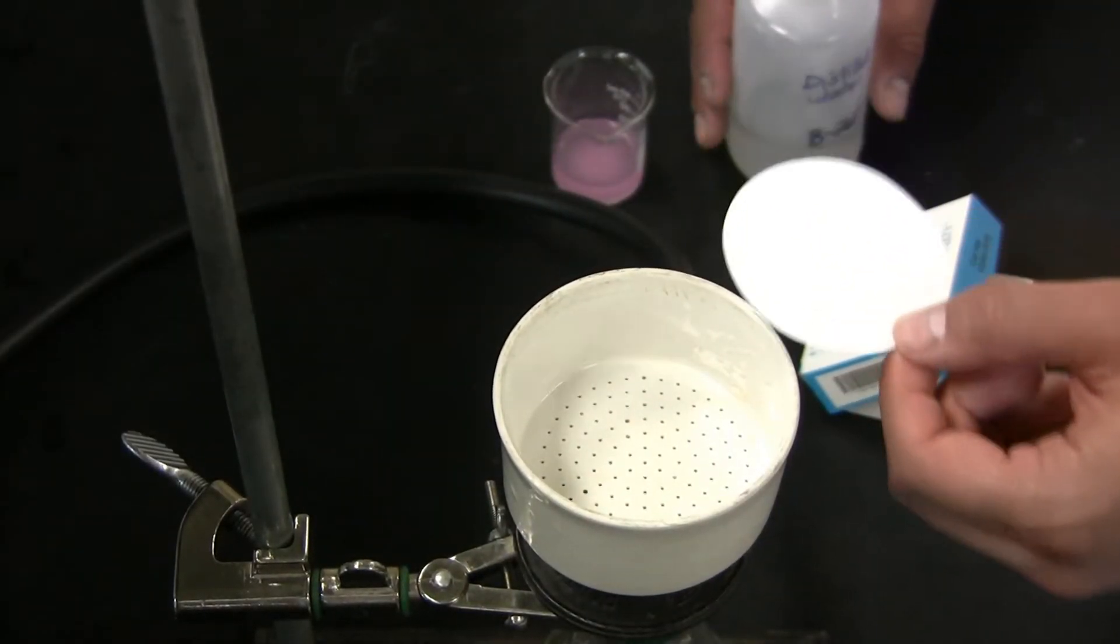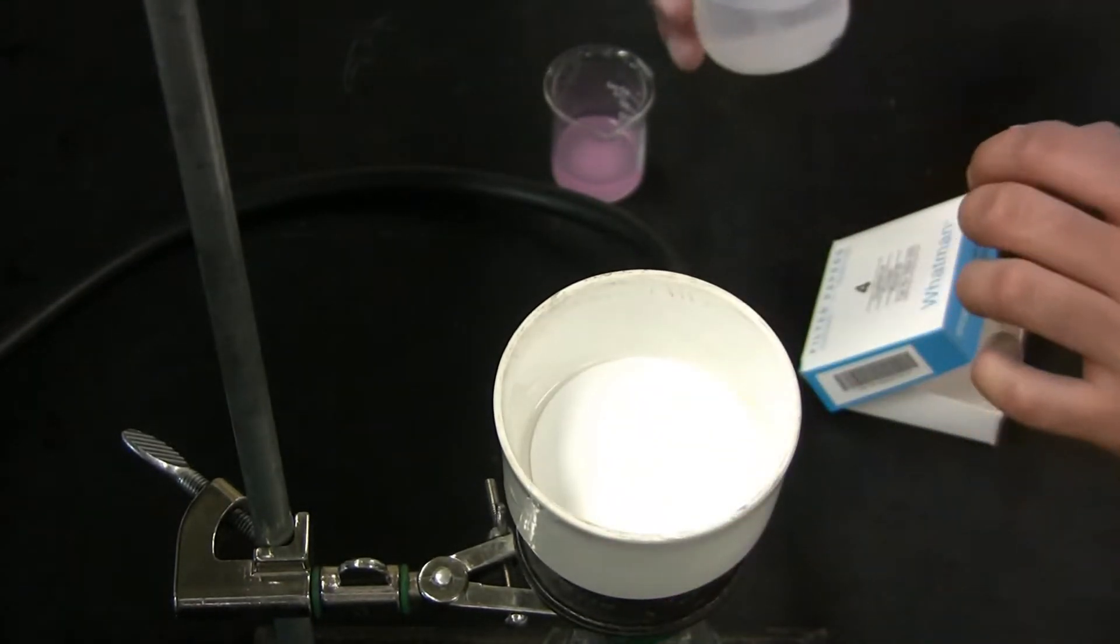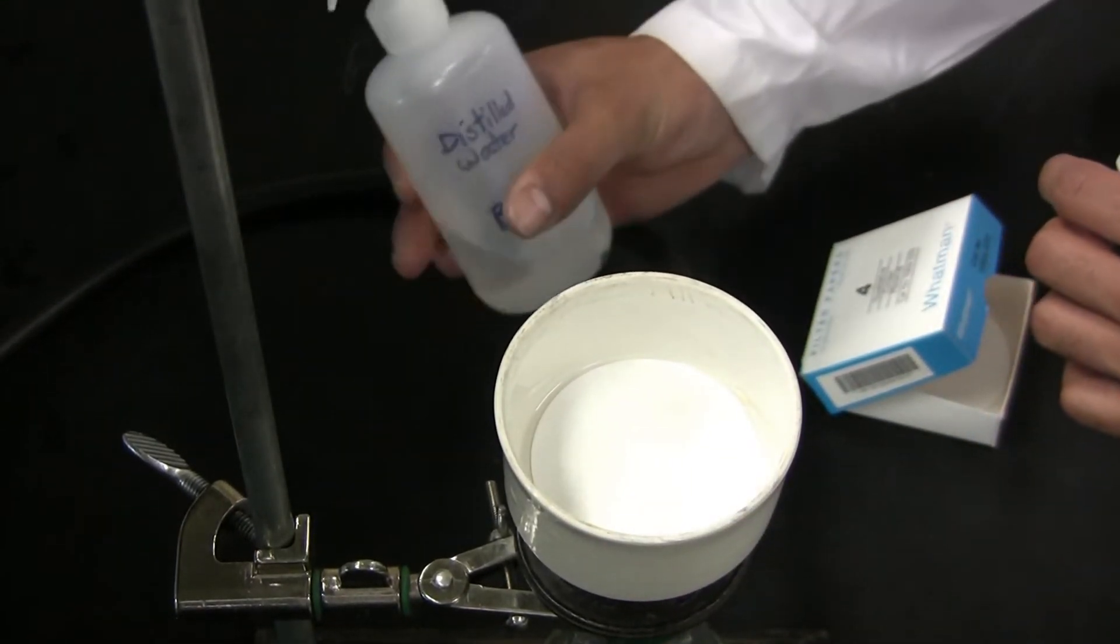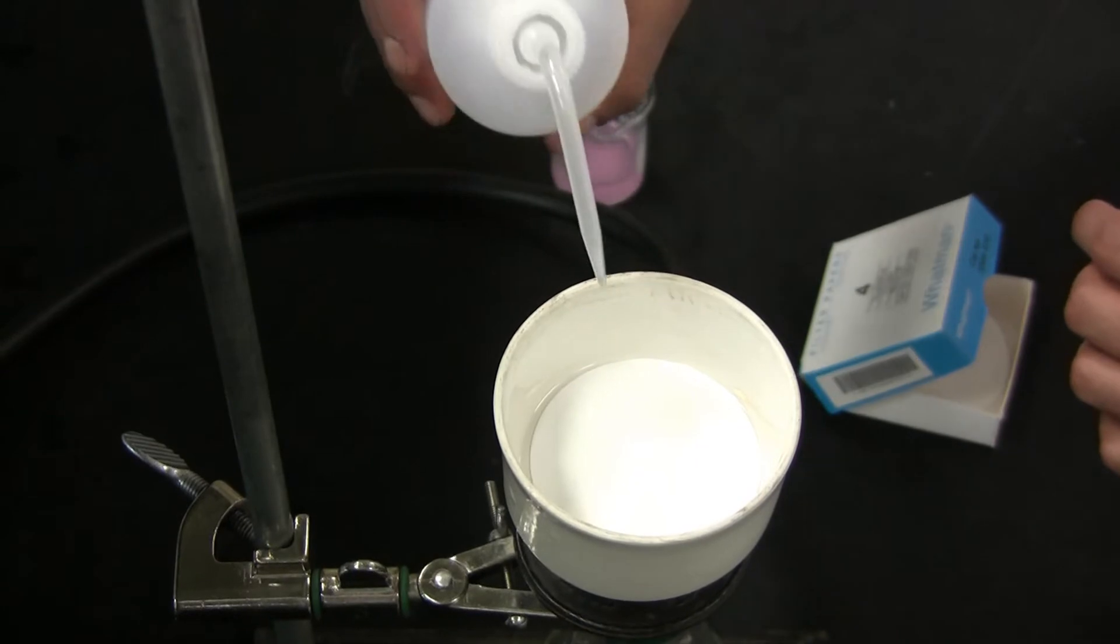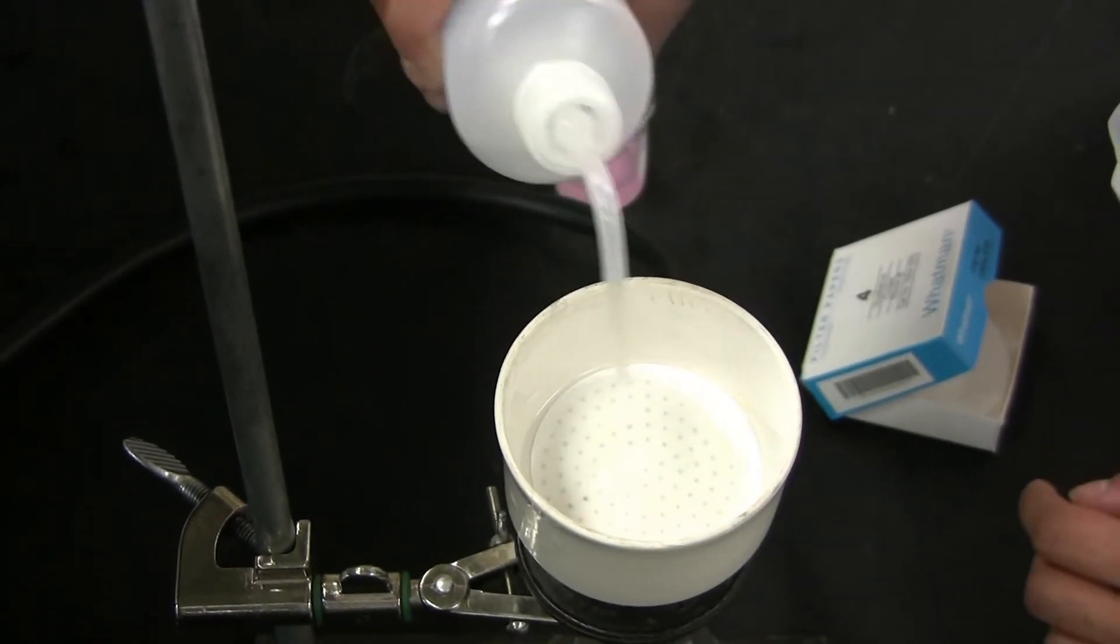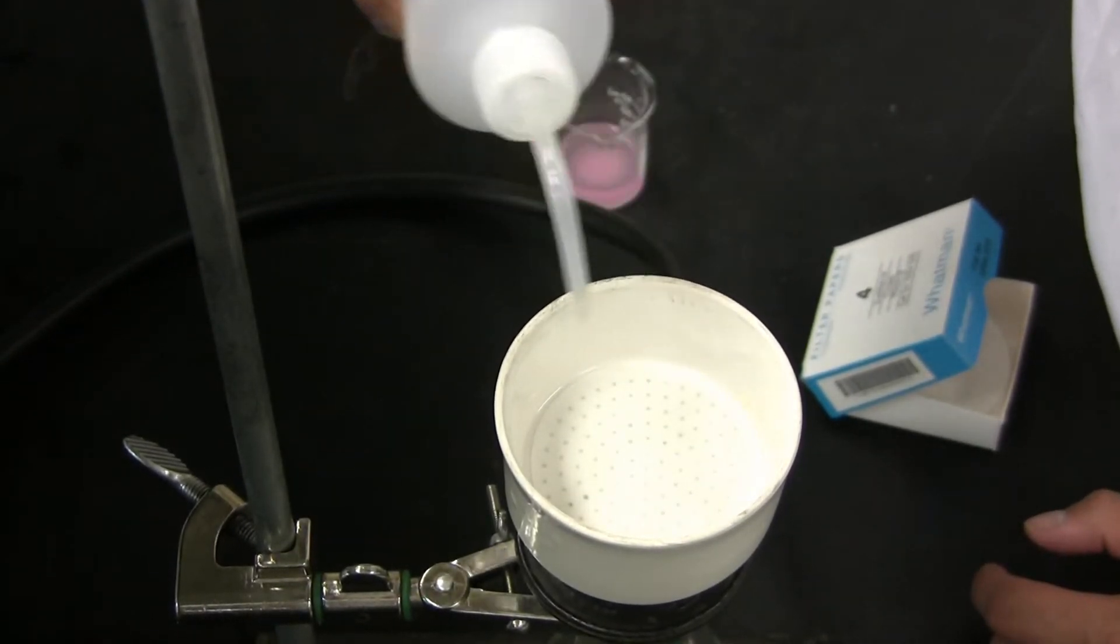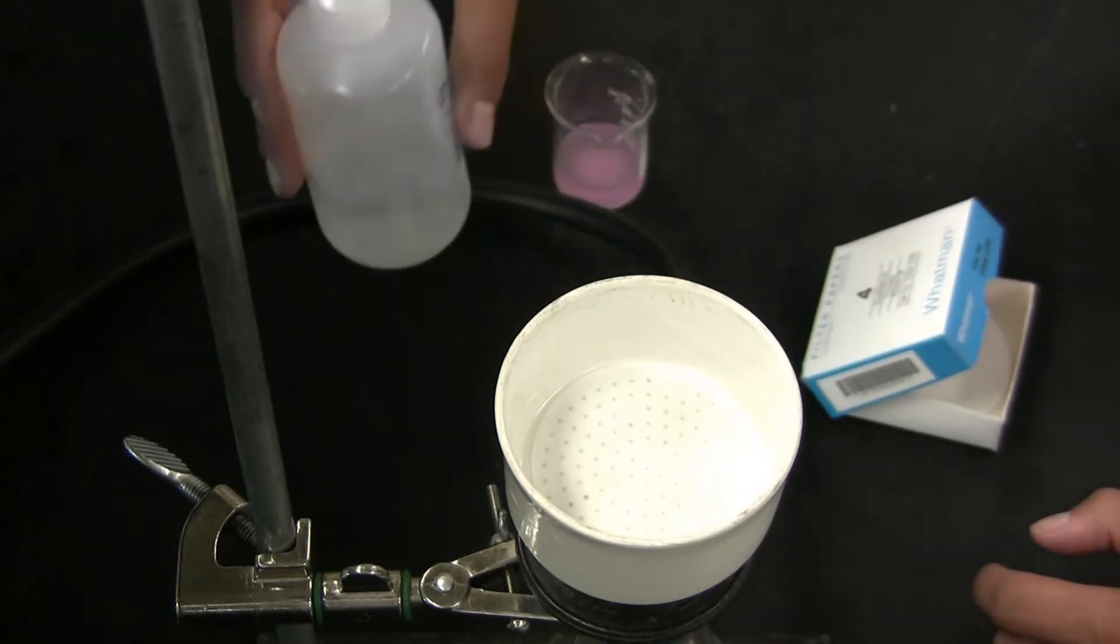Place a piece of your filter paper into the Buchner funnel. Using your solvent, in this case distilled water, make sure that it is stuck to the bottom of the Buchner funnel. Also, ensure that it does not curl up.